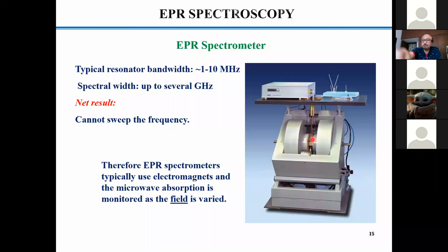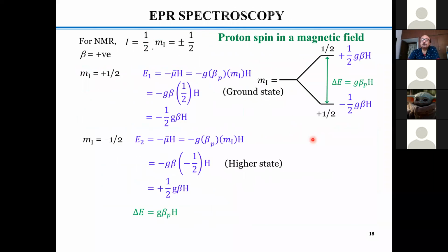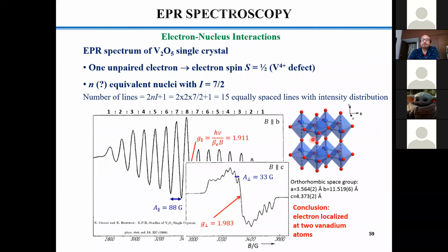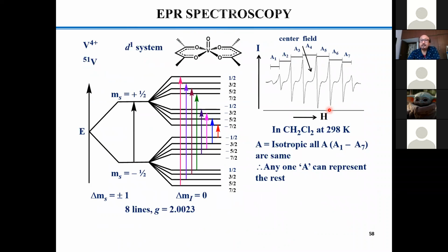So when you are scanning, when you are putting your sample tube within this magnetic domain, you have kept a little bit of your radical. So the sample spectrum will come the way it has come for vanadium or any other case, and the radical would also respond. Say the radical has come somewhere here.